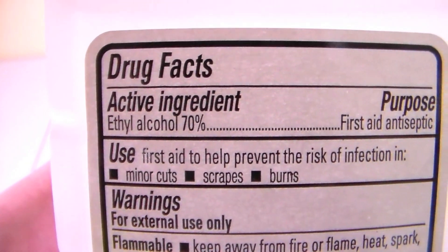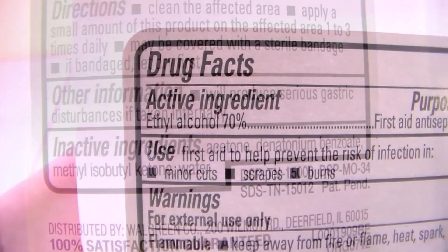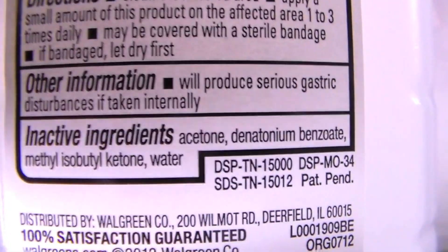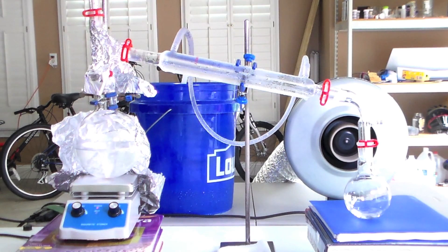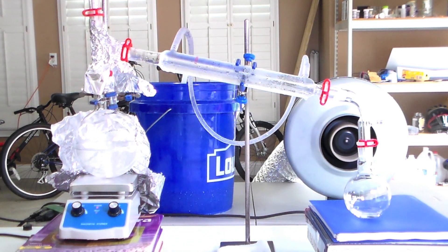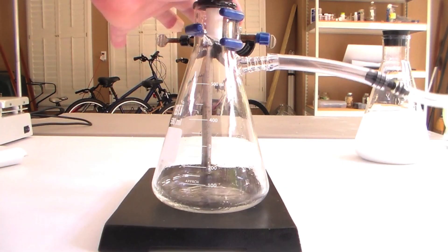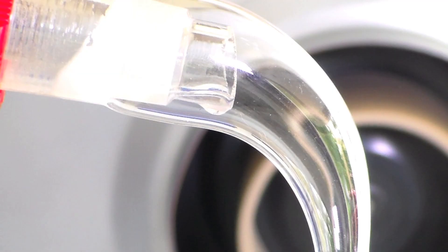It typically contains ethyl alcohol and water, denatured with small amounts of acetone, methyl isobutyl ketone, and denatonium benzoate. In this video we will separate the ethanol from all of these contaminants to obtain nearly pure ethanol.